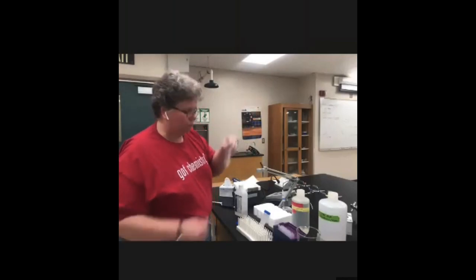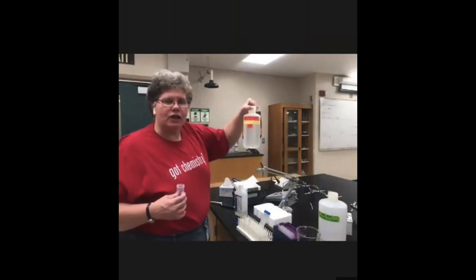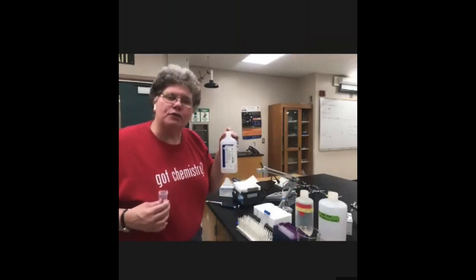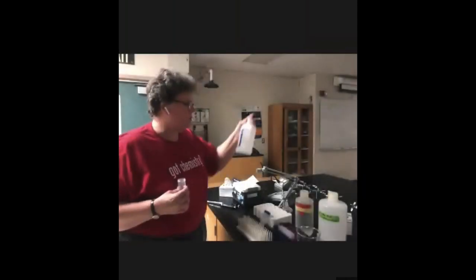And then when we do that, we're going to add a small amount of 3 molar sodium acetate. That's in your protocol. And we're going to add 100%, 200 proof ethanol to this.